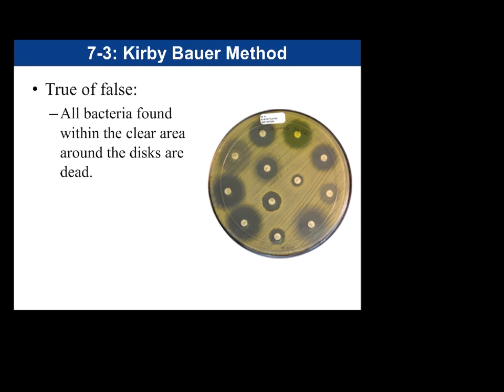True or false? All bacteria found within the clear area around the discs are dead. So what that is asking is, just because you see a clear area here, does that mean everything in that clear area is dead? So if you were to culture it, are any cells viable? The answer to this is false.